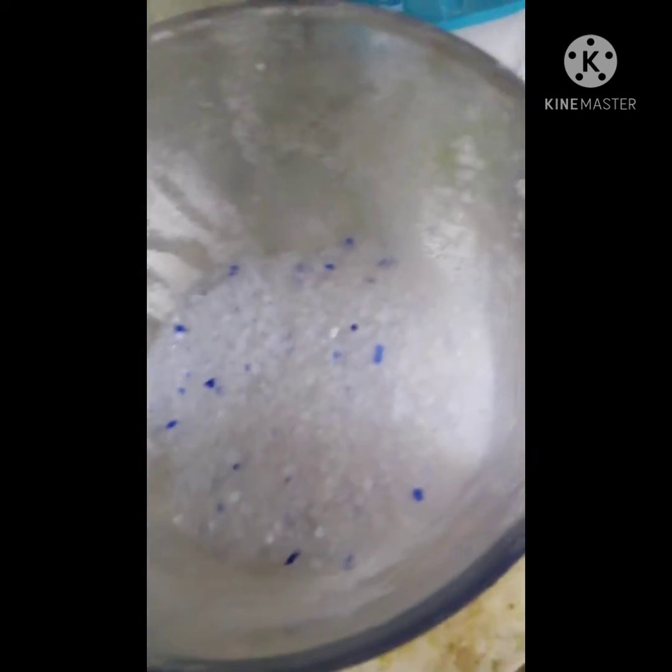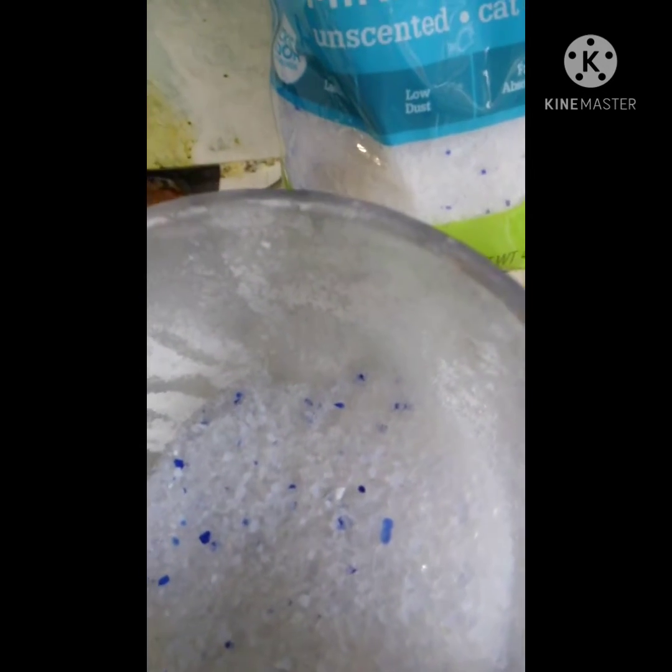This is in a blender right here, so I'm going to blend it up to a powder. Be very careful if you do this, because the powder will cause silicosis — or if it were from a volcano, it would be called Pneumo Ultra Microscopic Volcanoconiosis Siliconeosis. It's not something to laugh at; it's seriously dangerous. So be very, very careful if you decide to blend this stuff up to a powder.